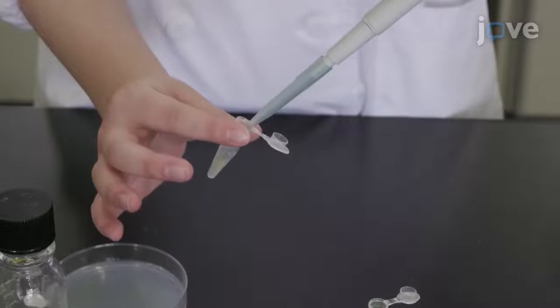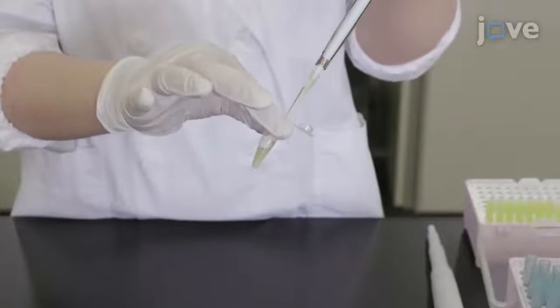Add Hoechst stain for a final concentration of 1 microgram per milliliter. Then let the cells incubate in the dark for 10 minutes.